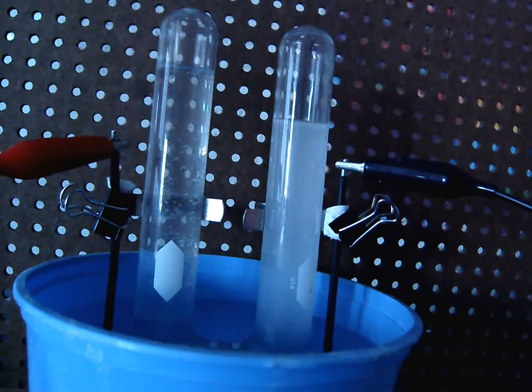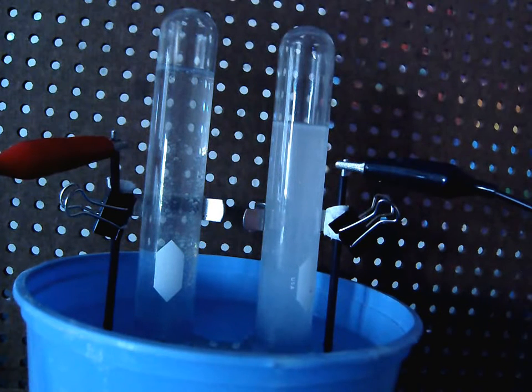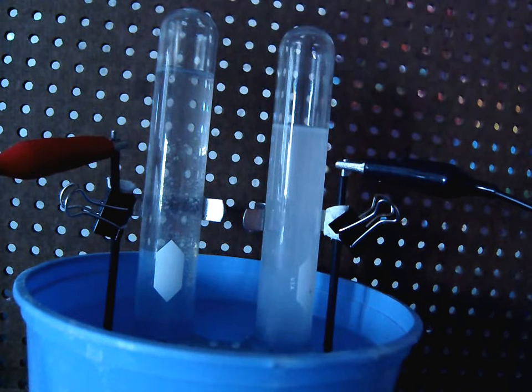So when we're looking at the test tubes, we can state some things right off the bat. We can certainly tell that whichever gas was produced here has a greater volume than the gas that was produced here. And when we measure it, we would find, in fact, this test tube collects exactly twice the amount of gas as this test tube. And so that can lead us in the direction of trying to figure out which one of those gases is the hydrogen and which one is the oxygen. And we'll come back to that in just a second.